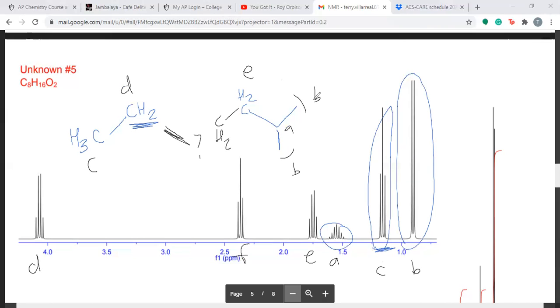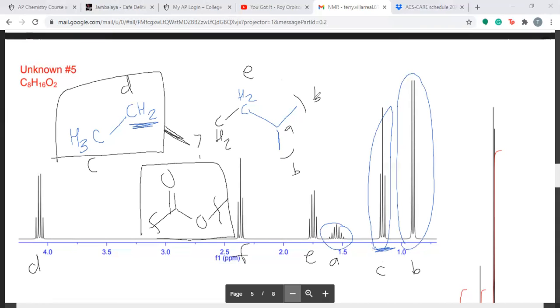And this is going to be F. So then I just need to connect that to my... So basically I have an ethyl, this ester, and then this chain with 5 carbons in it with an isopropyl at the end.